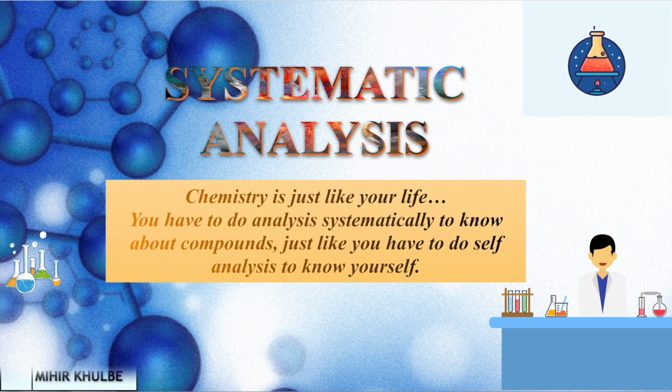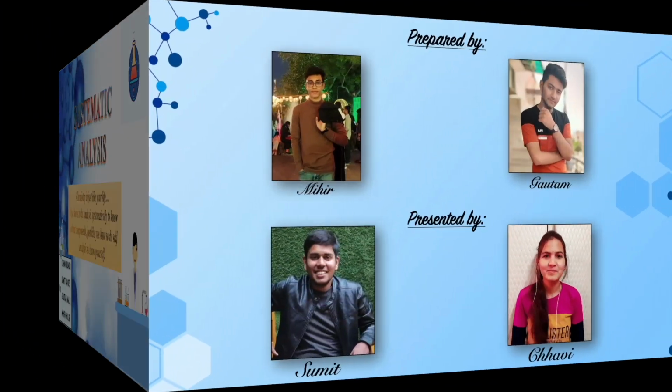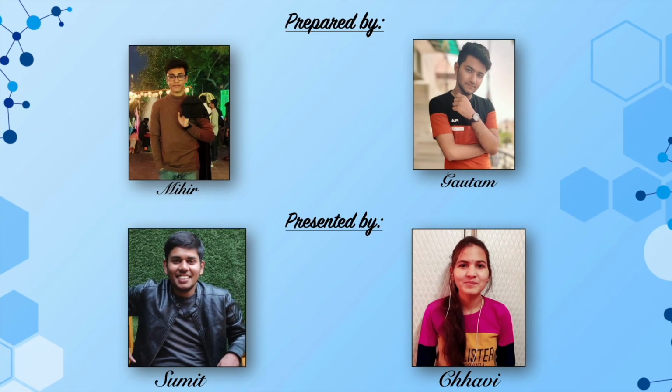It is well said that chemistry is just like your life. You have to do analysis systematically to know about compounds, just like you have to do self-analysis to know yourself. So hi folks, my name is Gautam, and today my team members and I are going to present to you the systematic analysis of carboxylic acid, and step by step we together will identify which carboxylic acid it might be. So, telling you about the work distribution, all four of us have collected the content.